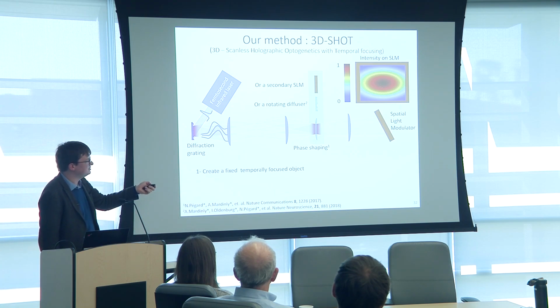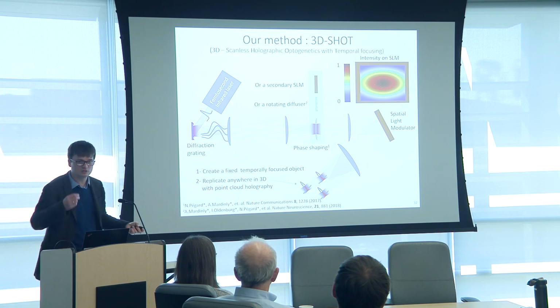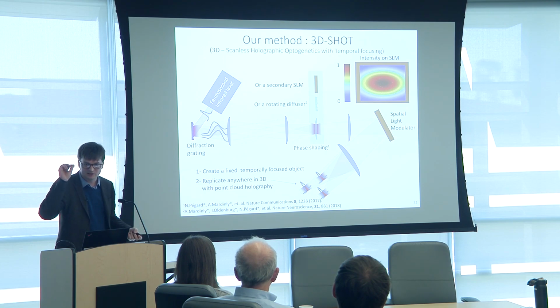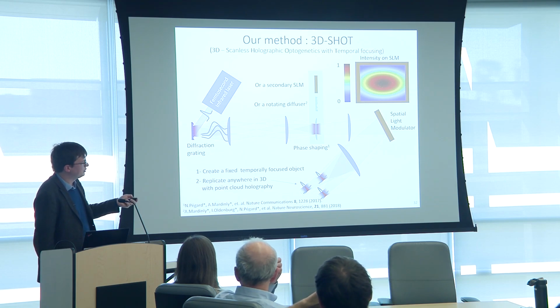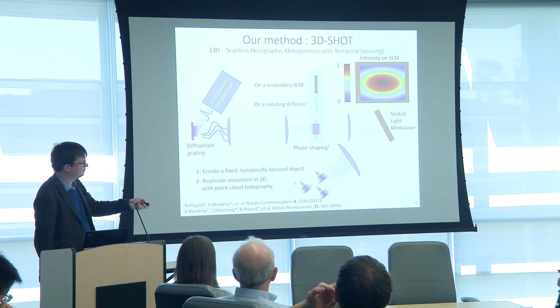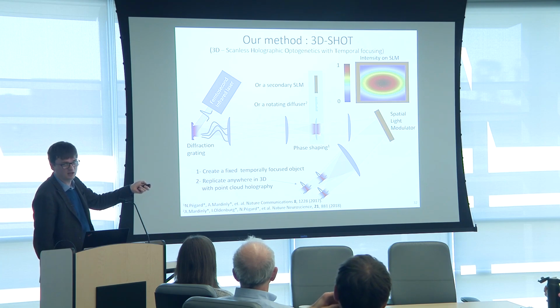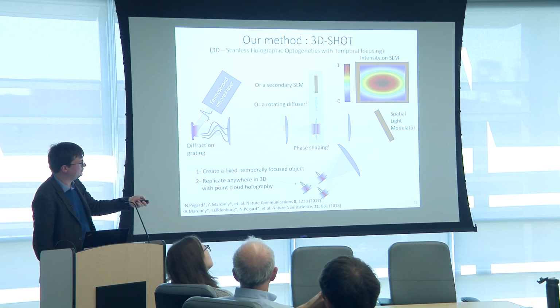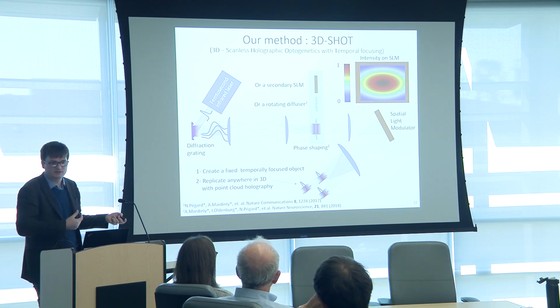But the SLM still stays in Fourier space, which means that if you apply, for instance, a holographic computation on your SLM, you say, can you, for instance, target those 3 points? And you literally compute a hologram that targets specific points, diffraction limit points. Your system will operate a convolution, which means that if you had a point source here, your hologram would target point sources. But because you have this temporally focused finite size object, at every point of your hologram, this device will create a copy of the temporally focused object at custom XYZ locations.